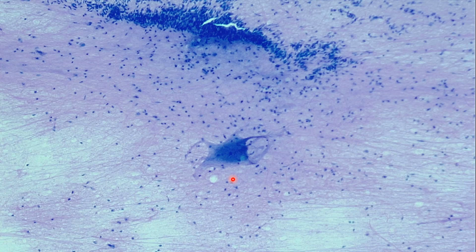Now, all of the purple dots surrounding are actually neuroglia. And neuroglia are supporting cells. So if something goes wrong in the nervous tissue, the neuroglia are the ones who are going to come and help to fix or repair things. Okay.